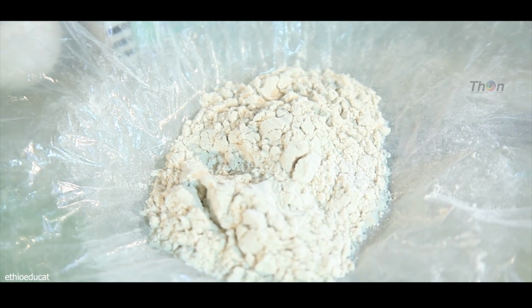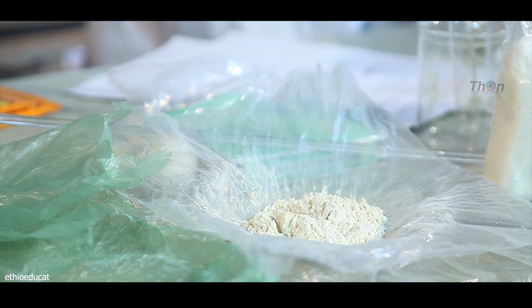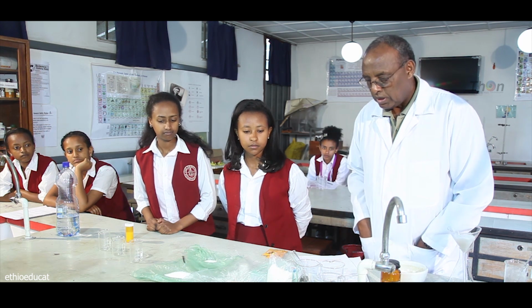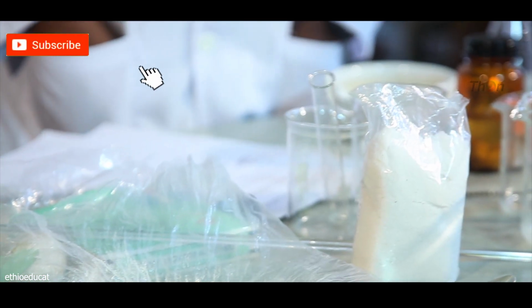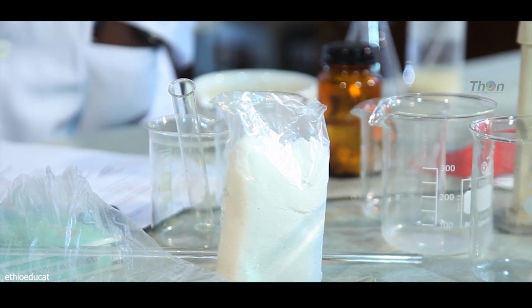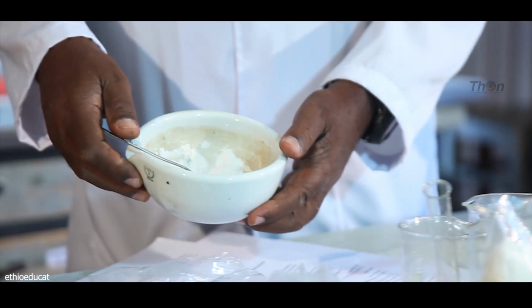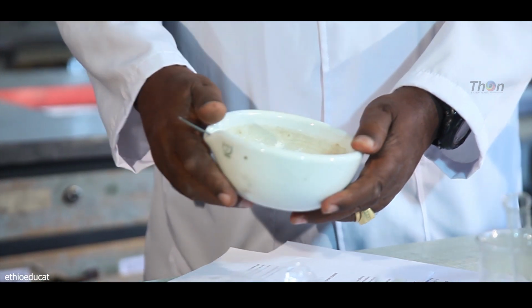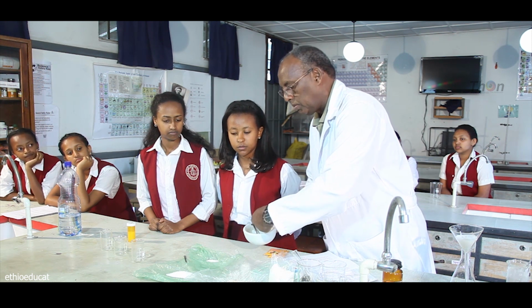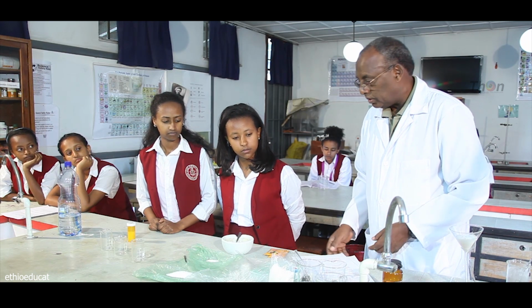Here we have ground flour, hoping we will extract as much starch from it. And here we have common salt, table salt, which is sodium chloride. It has come from the supermarket, so it is iodized. Here we have ground sugar. We're going to see if that will make a difference in solubility between the ground and the unground sucrose.